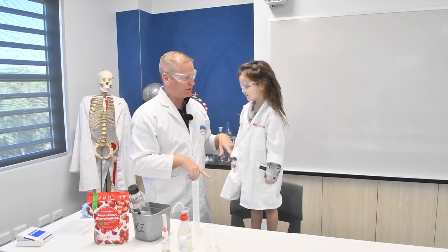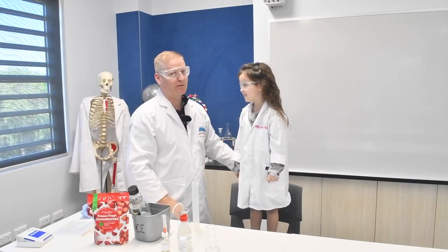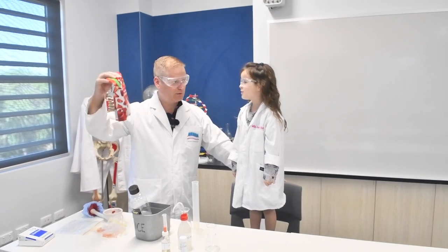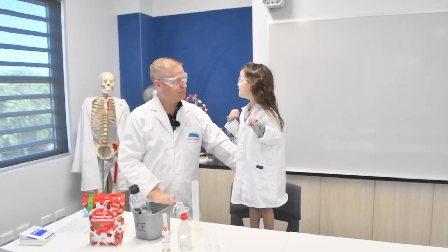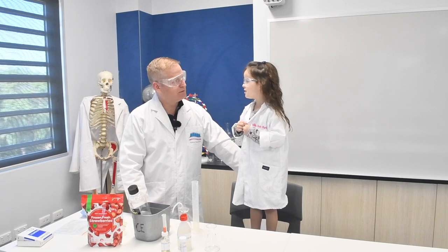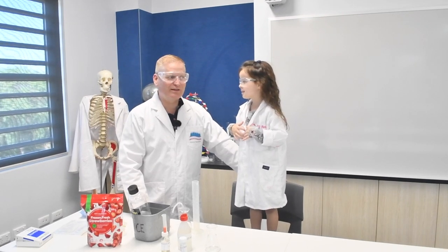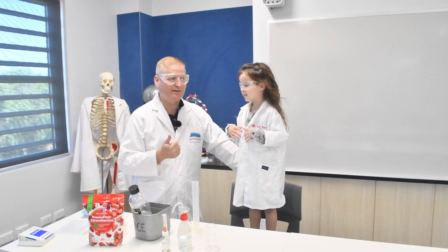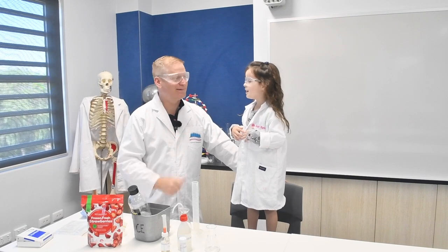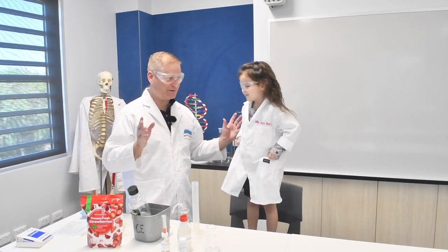Today, what are we going to do? Do you know what the experiment's about? I forgot again. What do you think it's about? What's this? Strawberries. Breaking strawberries, and what are we getting out of the strawberries? The oxygen. Not the oxygen. It's three letters. D, N, A. DNA. Okay, because DNA is inside every single living thing.